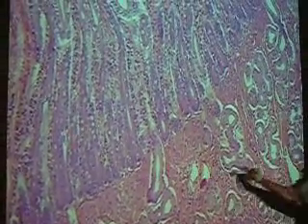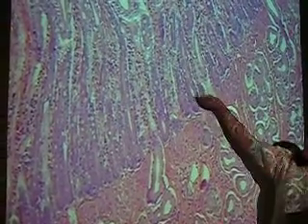And just one more question, and I'll go with that. Is there another gland besides Brunner's gland in here? And you need to go to the bottom of the villi. Intestinal. Good. And let's get you a shot right here. Yeah. All these places down here, like here, there are a bunch of them close together. That's an intestinal gland. And these, on the other hand, are what kind of gland? Duodenal or Brunner's, yeah. So the Brunner's glands are in the submucosa. The intestinal glands are at the bottom of the mucosa with the villi sticking up into the lumen. Okay, colon is next.